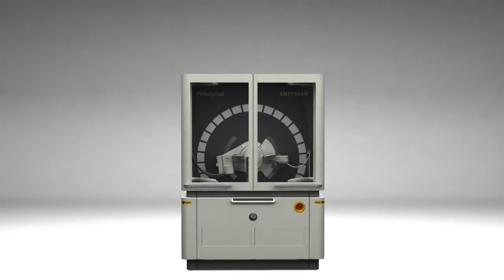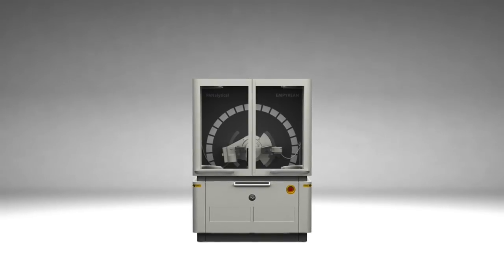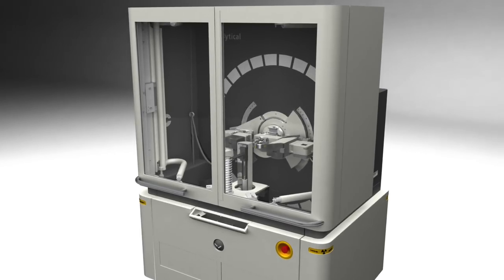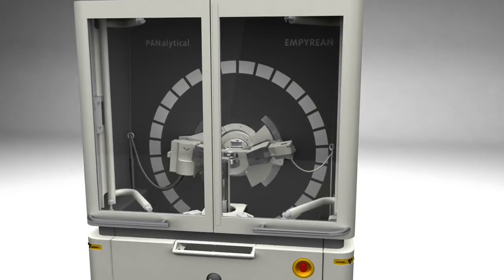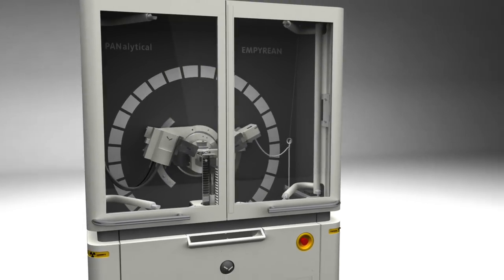Malvern Panalytical proudly introduces the third generation of Empyrean, the most advanced x-ray platform for high-quality structural analysis available on the market.